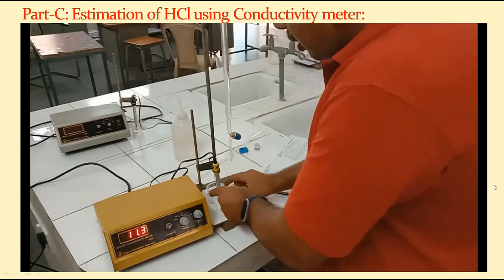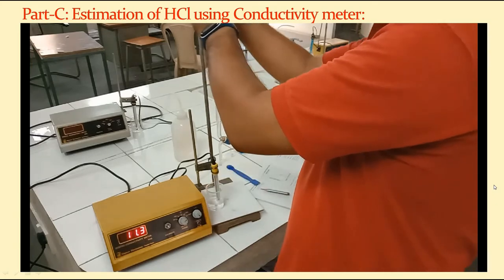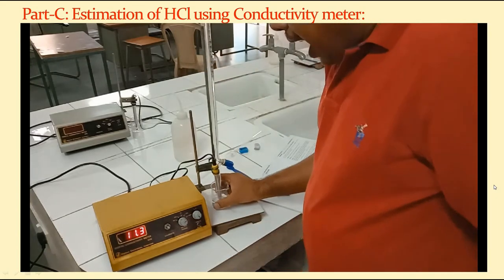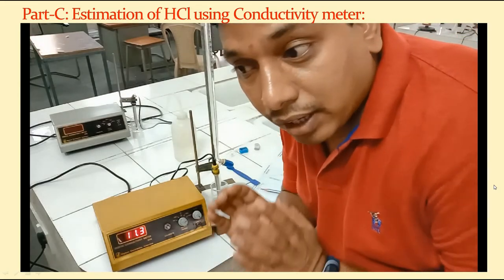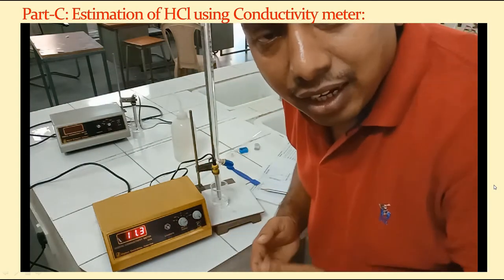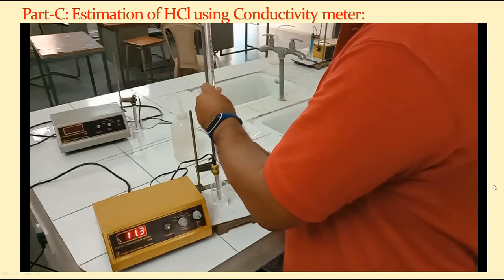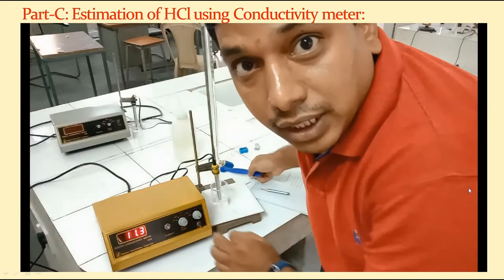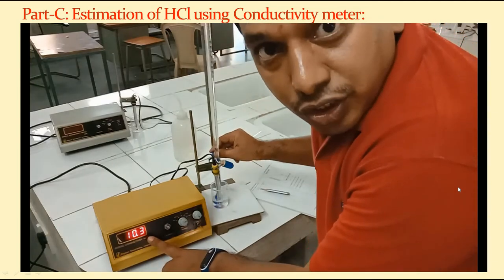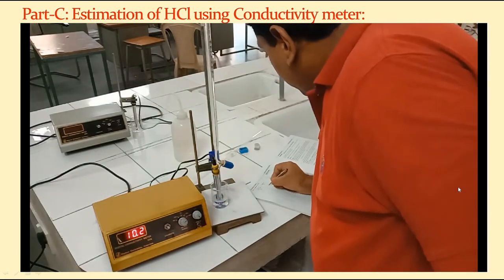Now I start adding this sodium hydroxide from the burette. We add the sodium hydroxide in 0.5 ml intervals or 1 ml intervals. To make it easy, I am going to add only 1 ml in each interval. First drop about 1 ml of the solution from the burette, then stop the cork. Now 1 ml of sodium hydroxide is dropped into the test solution. Stir it properly so that we observe some change in the conductance on this instrument, and note down the reading. So at 1 ml, this is the change in conductance, and it is about 10.2 millisiemens.